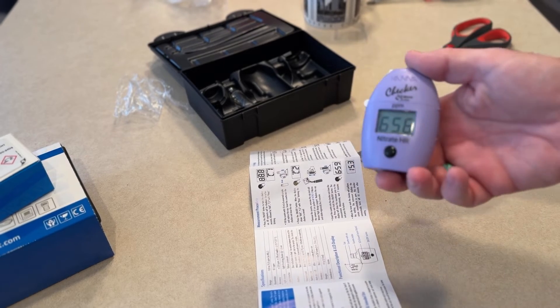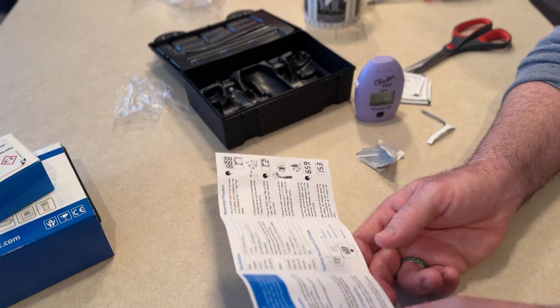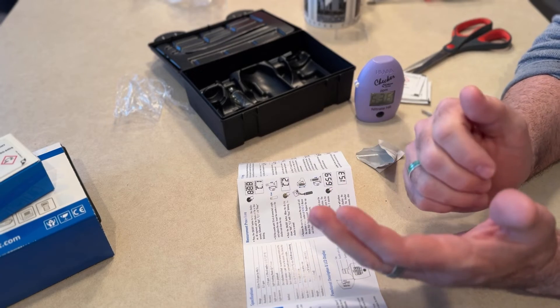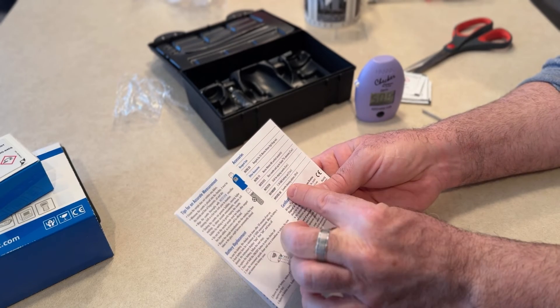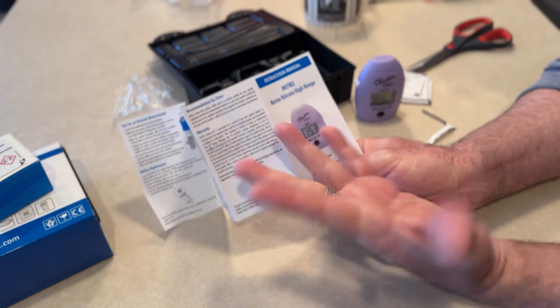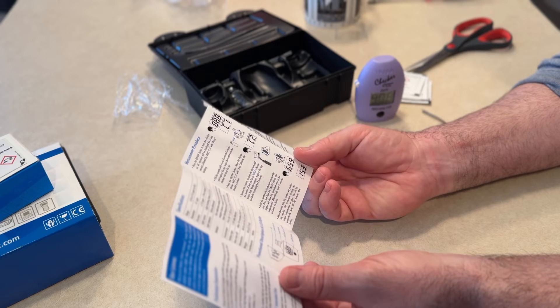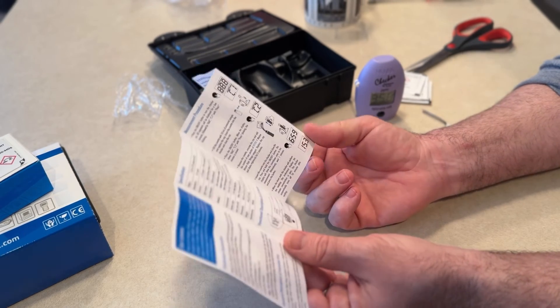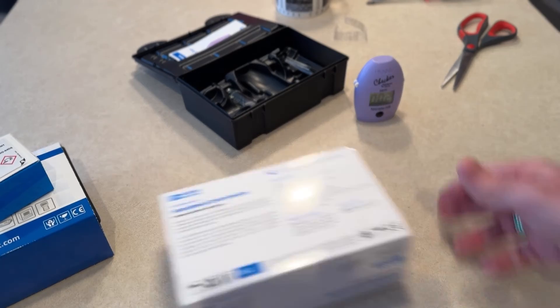That's seven minutes — so after seven minutes it'll give us the reading. But does it show you what high or low means? Like obviously your test kit is going to give you a card to show you what the reading means. They sell all these accessories you can buy, even a cloth wipe and bottle cleaning solution. As an example, if it shows 15.3, what does that mean? I'll have to just use Google. It would be nice if they included a little card telling you what low, medium, high, or super high nitrates are — like all other test kits include. After 10 minutes, the unit turns off on its own, which is nice.